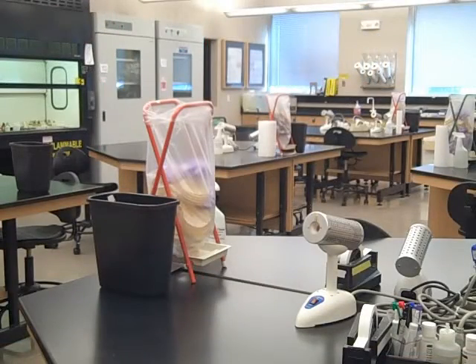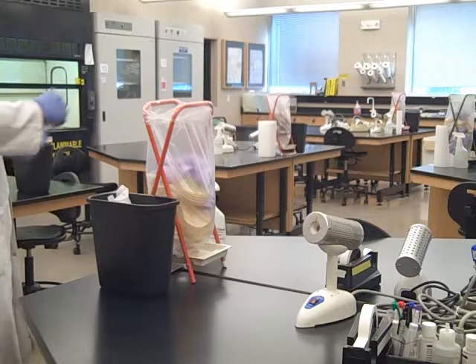There are two trash cans on the lab bench. There's a black trash can — this is where you dispose of regular trash that doesn't have live microorganisms on it, such as the paper towel you use to dry your hands after washing or the paper towel you use to disinfect the lab bench. Next to it is the autoclave trash, where you dispose of trash that might have live microorganisms on it, such as used gloves or paper towels used to clean up a spill.